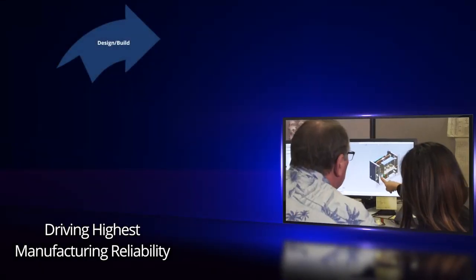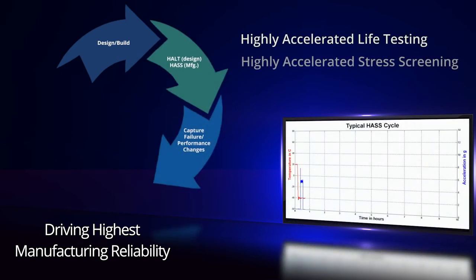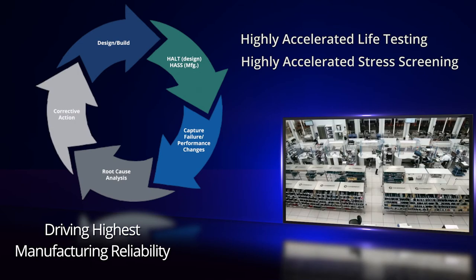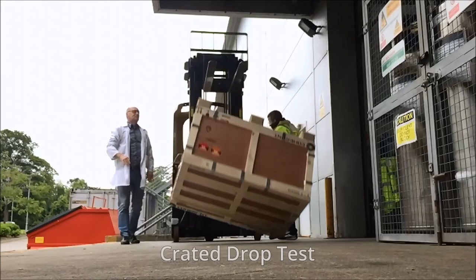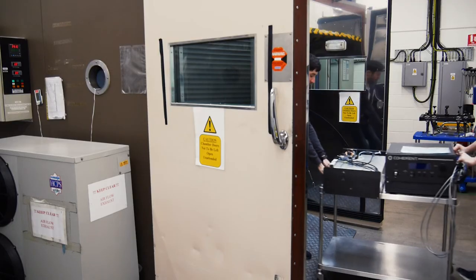Using the latest standards for design verification known as HALT, components, subassemblies, and systems are pushed to failure to verify design limits and maximize component lifetime. All systems undergo rigorous environmental stress screening such as vibration, shock, and temperature cycling.